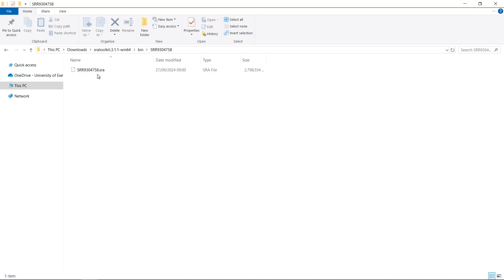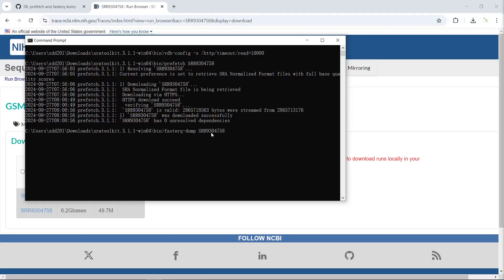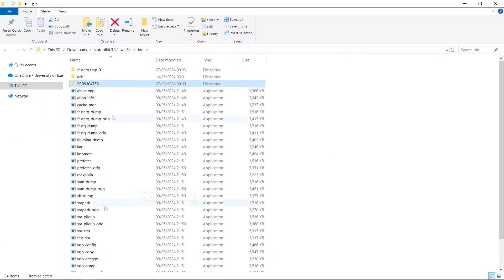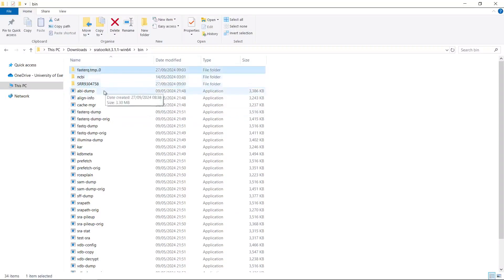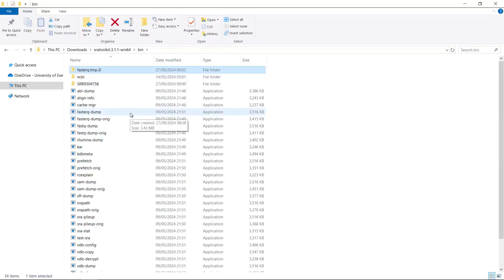You need the internet to run the prefetch function, but once you download the data you don't need the internet — you can just run the fastq-dump function. We use fastq-dump plus the SRA run number to extract the SRA file as a FastQ file. Let's run this function. Because I'm using the default settings, all the data will be extracted in the current directory — the bin folder. You can see the fastq-dump function is running and extracting the sequencing data. Once finished, the temporary folder will disappear and we will have a FastQ file.